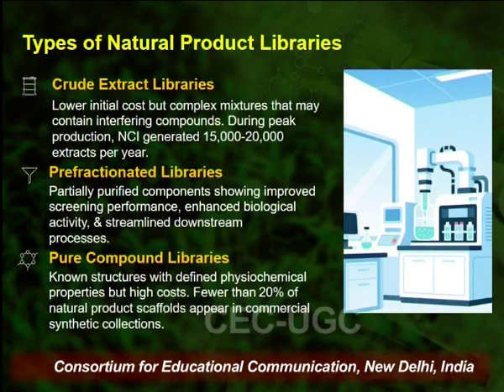In such kind of libraries, the extracts which we have prepared, we fraction those extracts into different fractions, whether in terms of usage of solvents in increasing order of polarity, so that we can differentiate the extract into fractions of different solvents in increasing order of their polarity. Or we further purify the extract by using an appropriate method and we get a suitable fraction that has the highest concentration of the required constituents in it. So, by purification we are basically removing the interfering compounds.